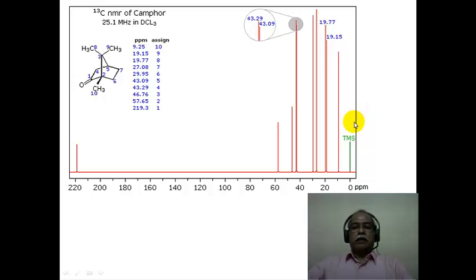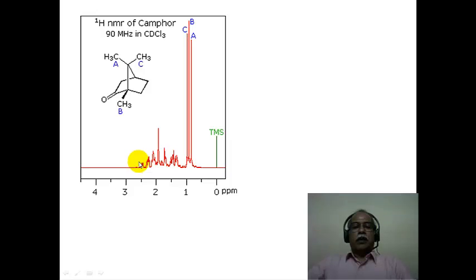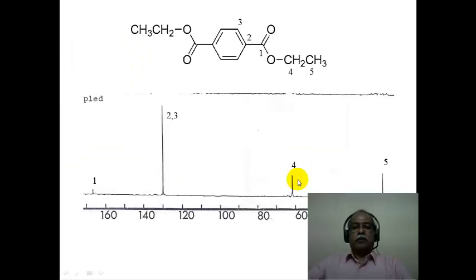So in some sense, the carbon-13 spectrum is a much more resolved spectrum because the individual carbons come at separate frequencies, and the spectral spread is also much higher, from 0 to 220 ppm, whereas proton is normally only from 0 to 10 ppm or 0 to 12 ppm or so.